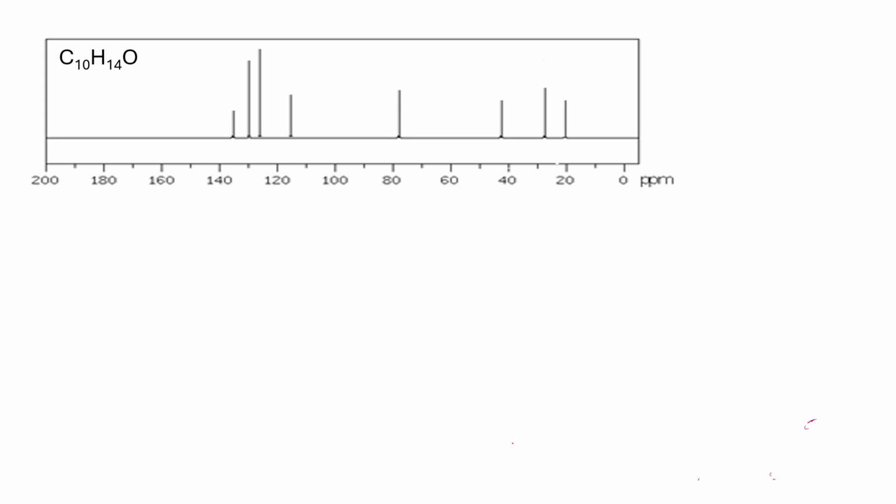problem. We've got our molecular formula, and we've got two NMR spectra, so we've got both carbon-13 and proton spectra. And the important thing when you have multiple spectra is to use them in an integrated way. In other words, don't just jot down a few things about the C13 and then forget about that while you're looking at the proton spectra. Use what you've learned from the C13 to help you make sense of the proton spectra, and that's the way to approach these kind of problems.